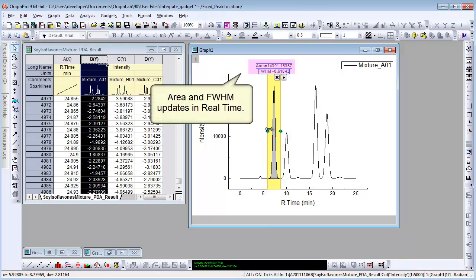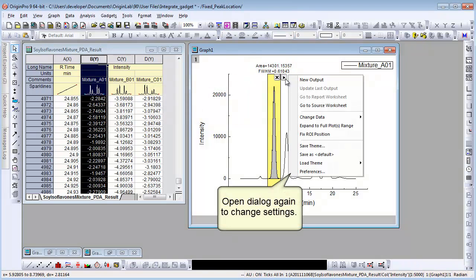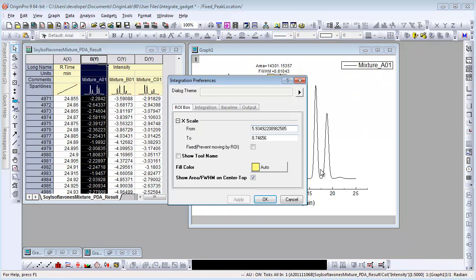We can click the arrow and choose Preferences to open the dialog again to change settings. Let's fine-tune the region of interest to some round values, for example from 6 to 8.5.